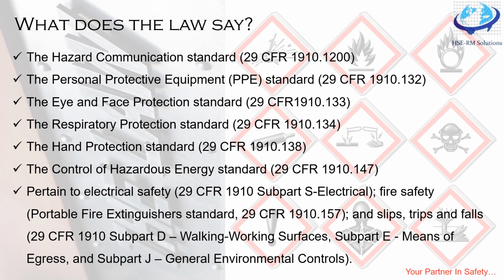We take it very casually, but one must understand that when we say release of energy, it doesn't always mean energy supplied to the equipment or system, but also energy generated by processes and operation of the machine. Stored energy or energy generated due to the process is required to be considered, well communicated and well designed. If energy is present, on its release, it will impact the individual working in that area. Lastly, pertaining to electrical safety, that is 29 CFR 1910 subpart S, electricity, fire safety, portable standards, slip, trip, falls, so access and egress.